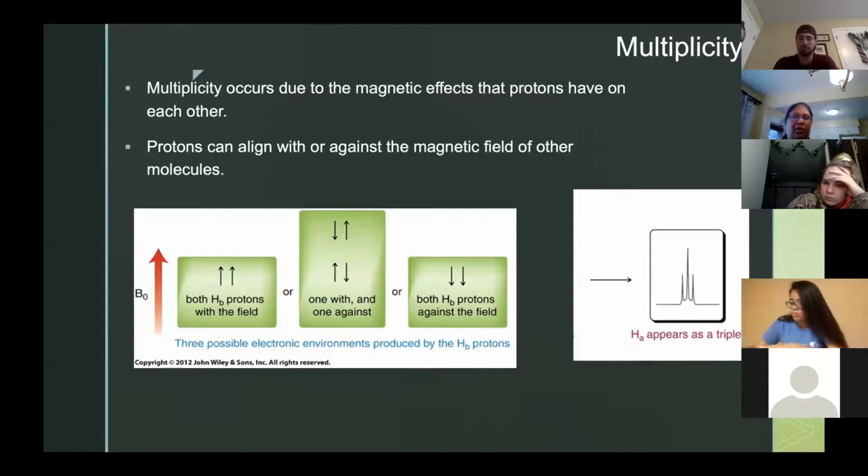So Hutch is trying to tell you, if you look at the three peaks, a triplet, you will see peak 1 and peak 3 are of the same height, but the peak in the middle is taller. He will now explain why the triplet is of the shape that you see on the right.